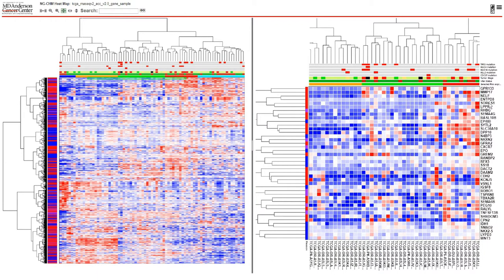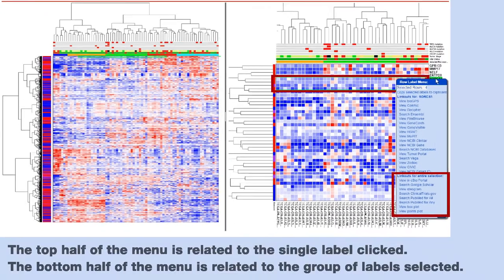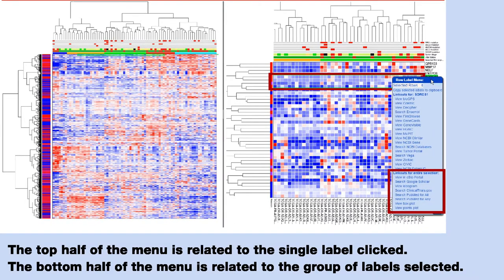If one or more labels are selected, the label menu contains additional entries that apply to the selection. When one of these entries is selected, the menu action will apply to the selected label or labels.